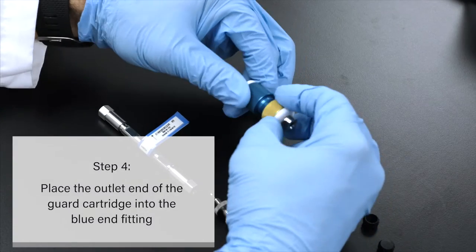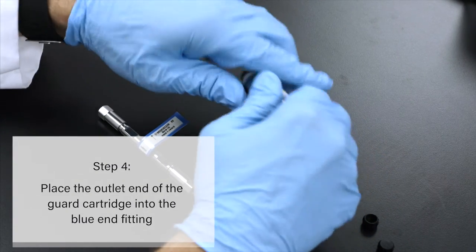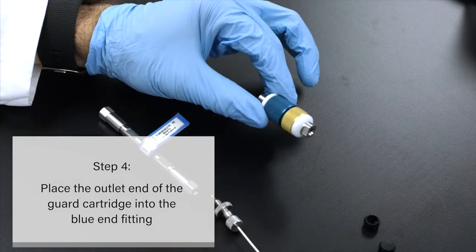Place the outlet end of the guard cartridge into the blue end fitting of the Sentry Guard Cartridge Holder and tighten the two halves until finger tight.